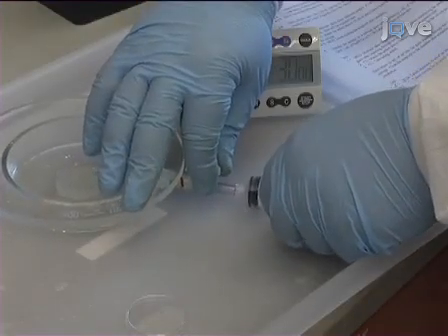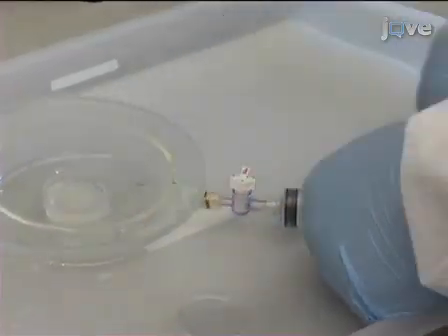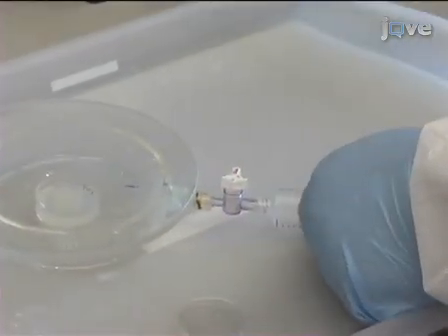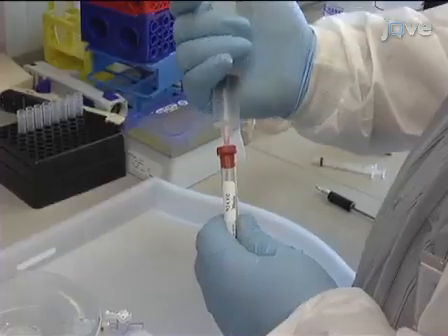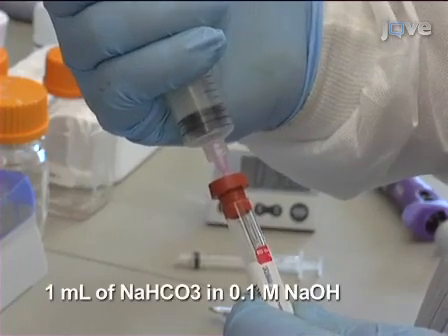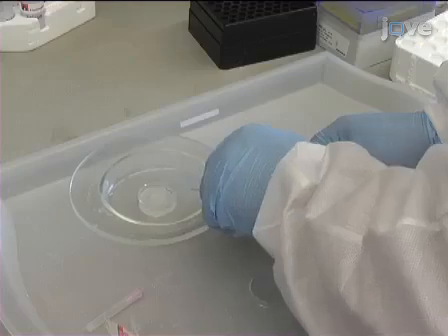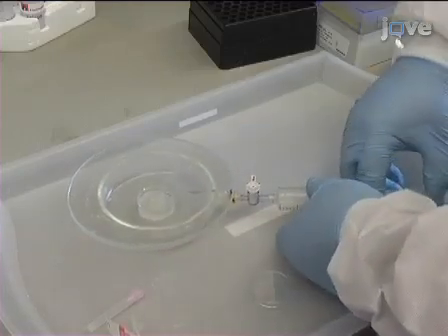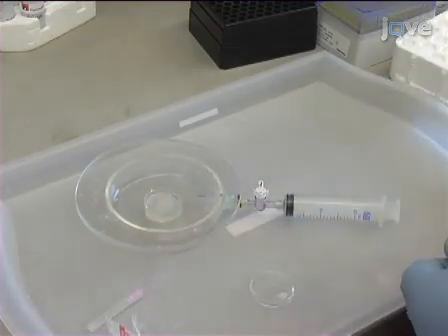30 minutes later, use a 20 milliliter syringe to sample 10 milliliters of the atmosphere from the glass chamber by the 3-way stopcock. Close the stopcock to the chamber after sampling. Transfer the sample to a red top vacuumed glass tube containing 1 milliliter of sodium bicarbonate in 0.1 molar sodium hydroxide.